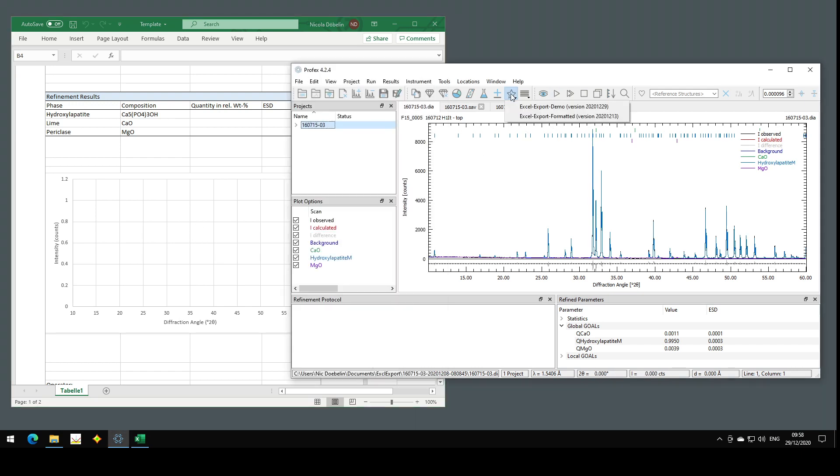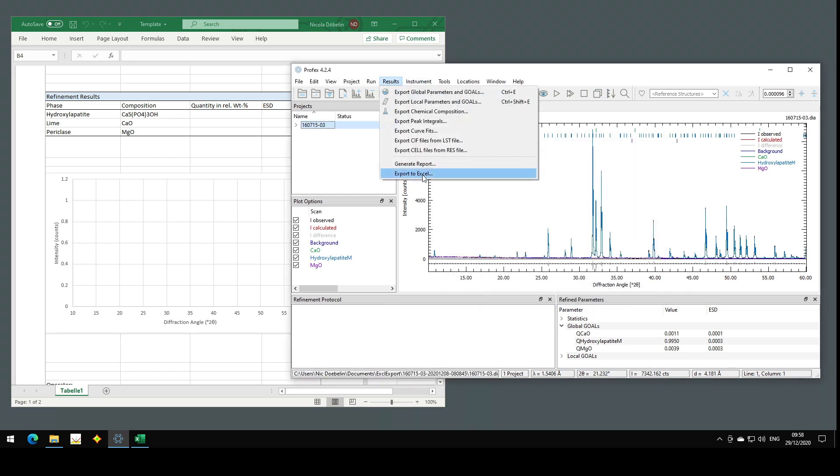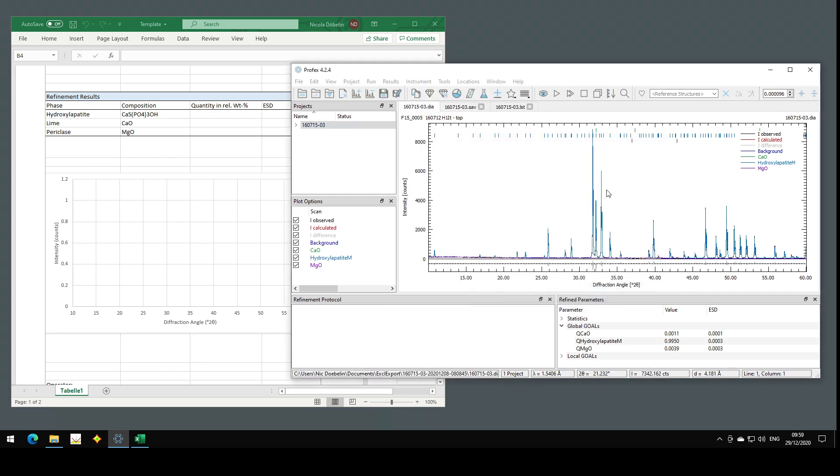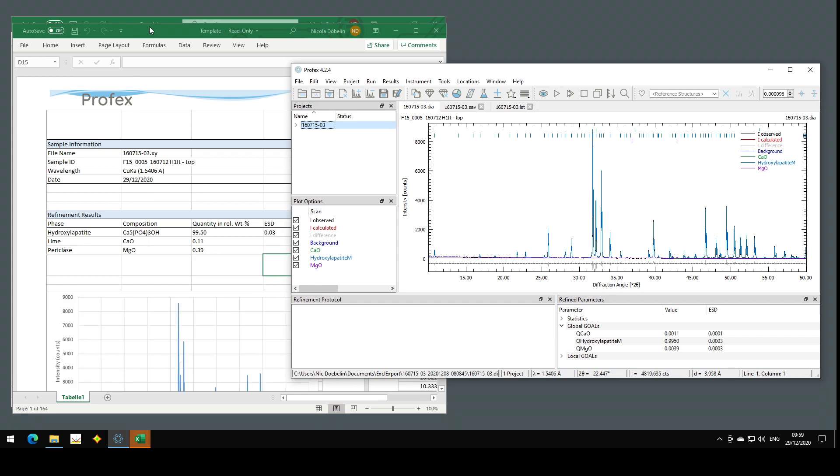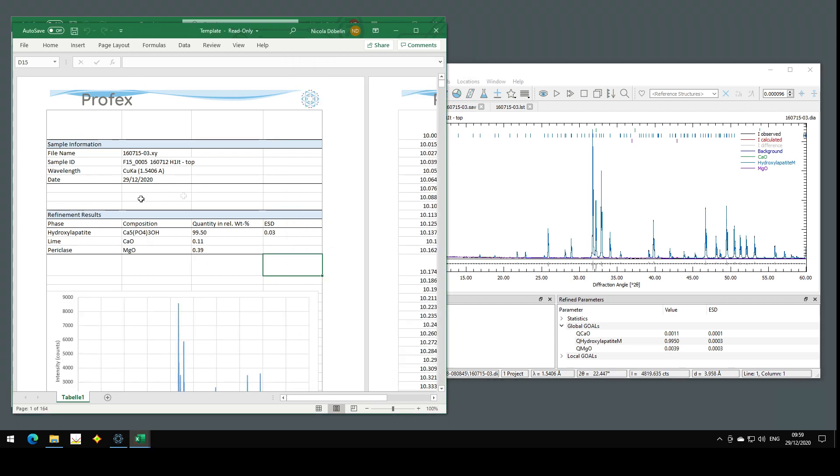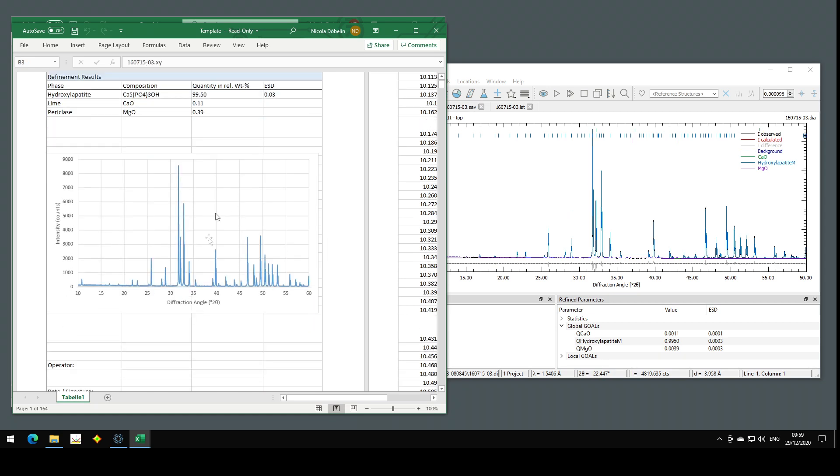Let's have a closer look at this configuration. So first of all, let's test if it works as expected. I export the results. And it seems to work as expected. So I get my sample ID, my file names and the quantities and the diffraction pattern here. Now let's have a closer look at this configuration.